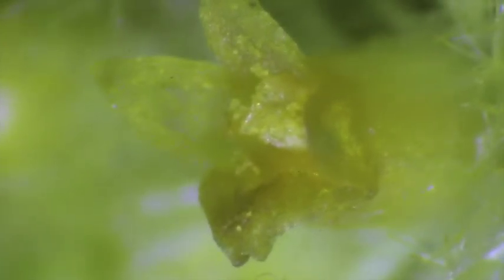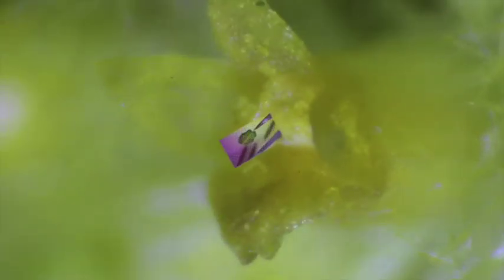Move that just barely there. Hey, got it. Okay, I'm just going to zoom in really close then, and we can kind of check this guy out super close. Okay, you can't quite see any of the internal features of it, but we can kind of see how this is an individual teeny tiny flower thing on the outside.